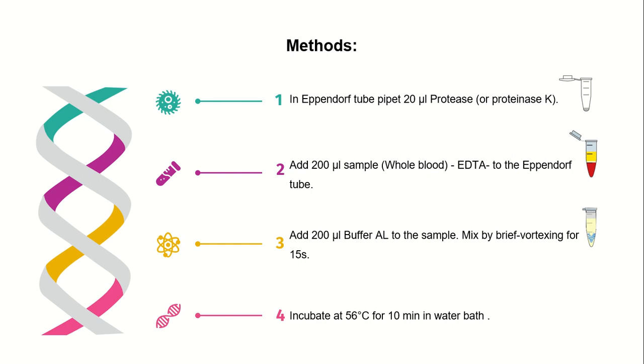Buffer AL acts as a detergent and lyses the lipids and cell membrane. Then we will incubate at 56 centigrade for 10 minutes in a water bath or heater.